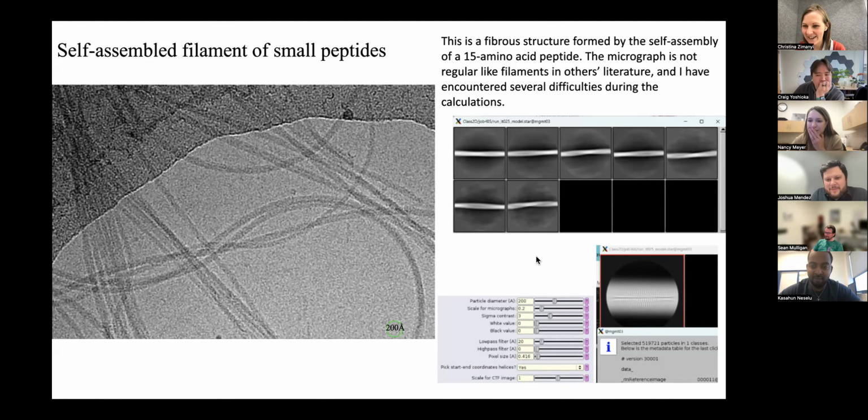The more knowledge you can get about the structure with alternative methods will help you the most, because it will guide you on your reconstruction, because you will have clues of what it's supposed to look like, and you're not going in blind.